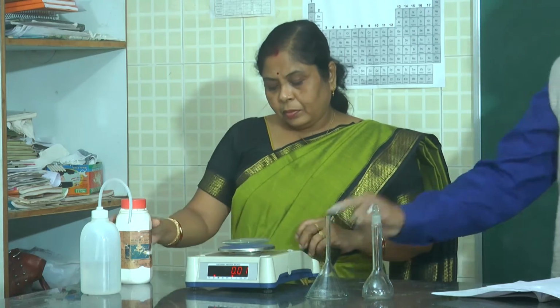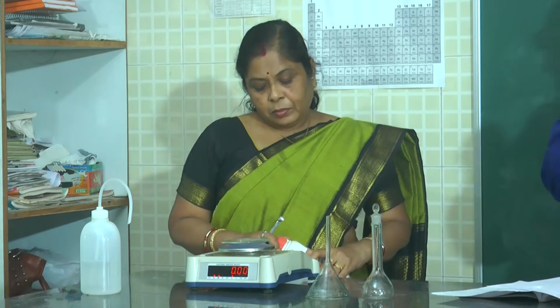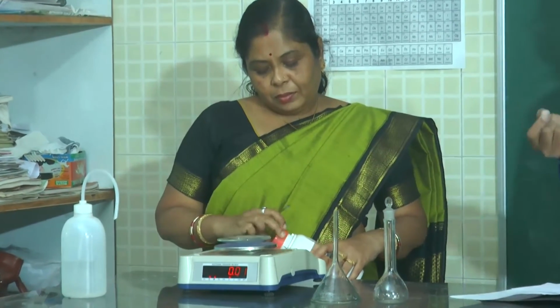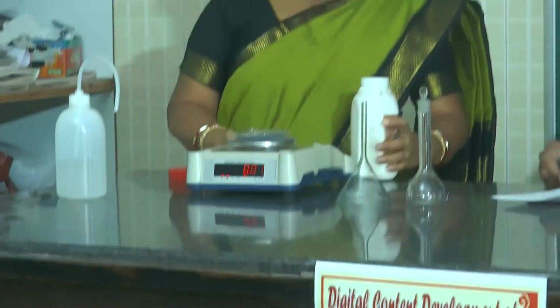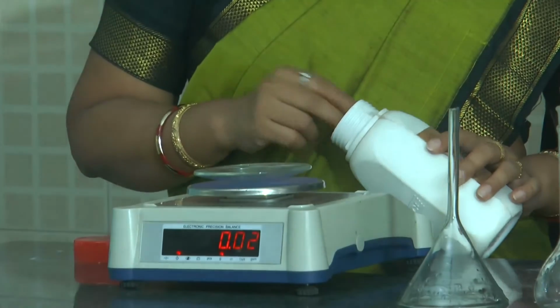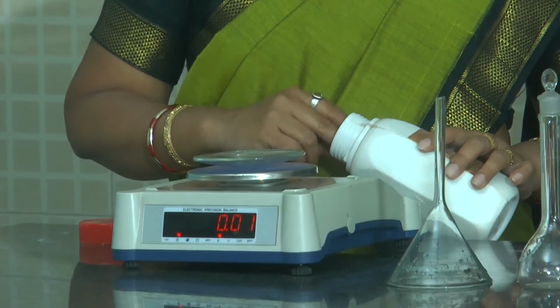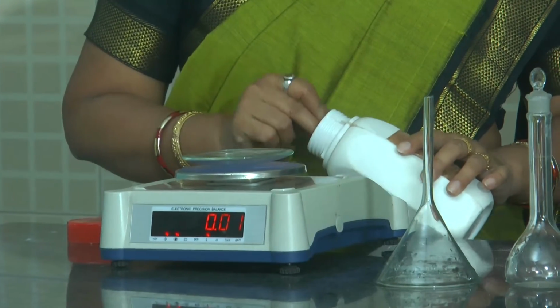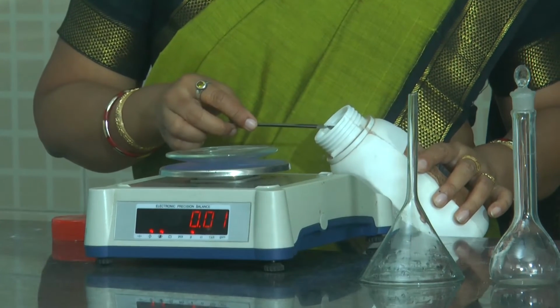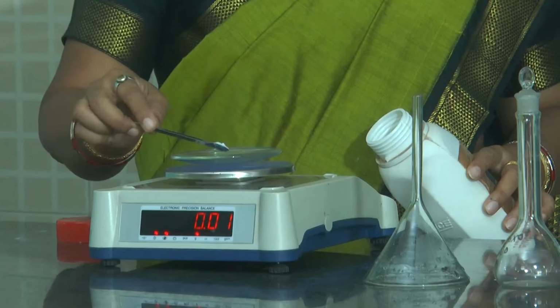And if you take the weighing bottle or this watch glass, you have to take the weight of the watch glass. With the watch glass you can manage up to 0 also. Or if you cannot manage at 0, then you take the weight of the watch glass and put the substance, and by the difference of weight you can find out the weight of the substance. And here you have to add such that it will come to 0.63 gram.